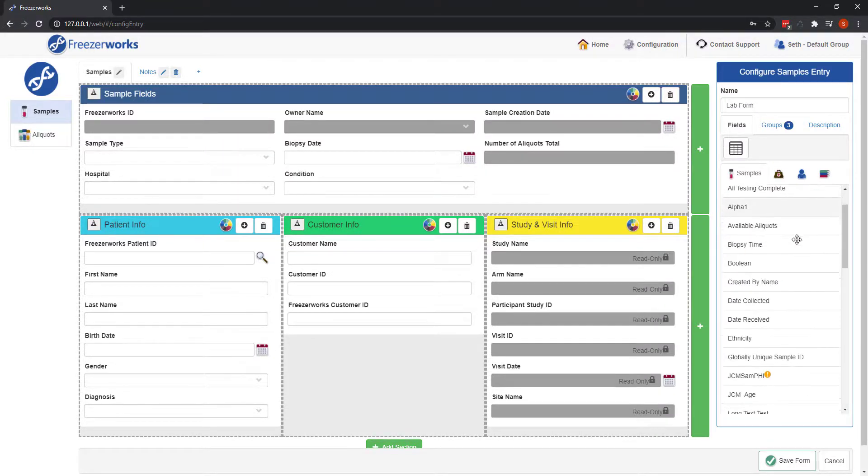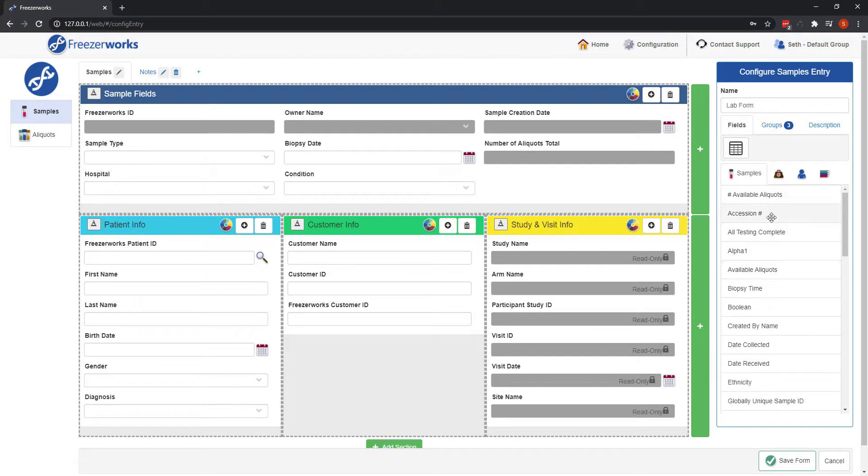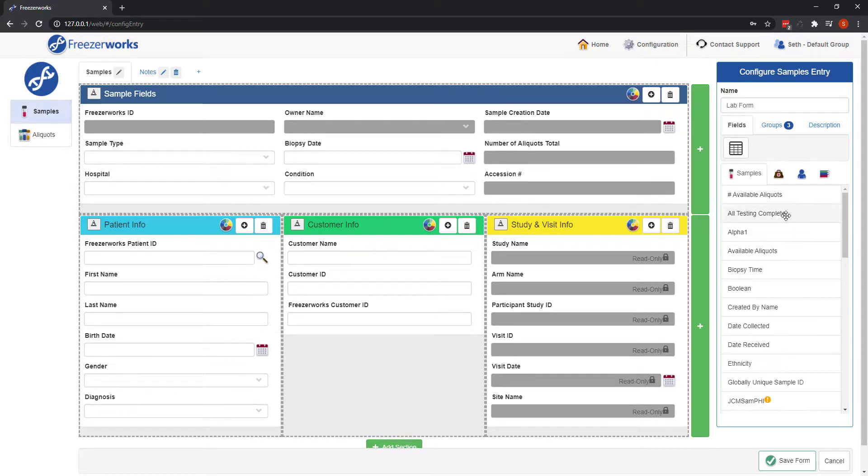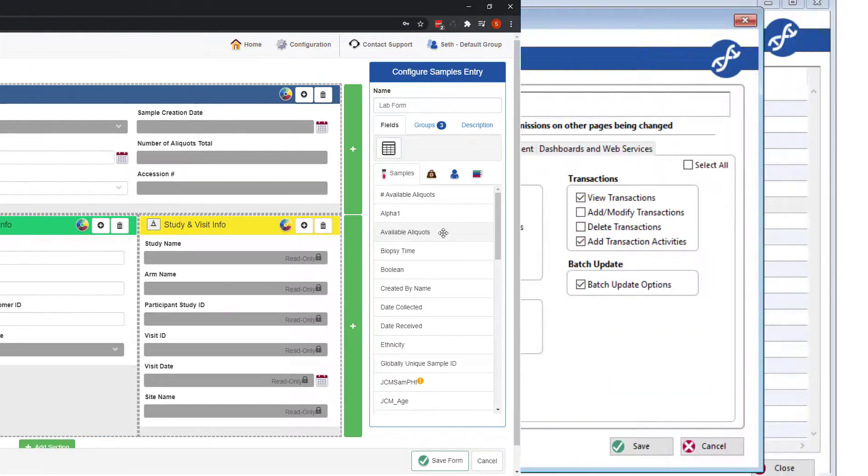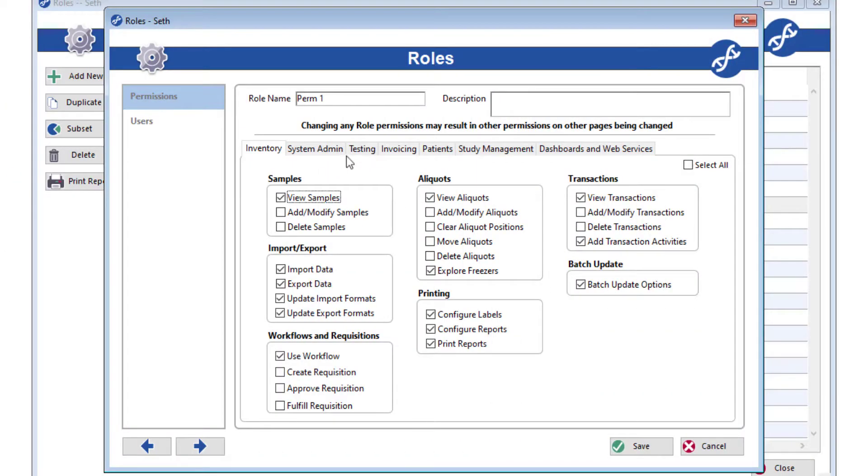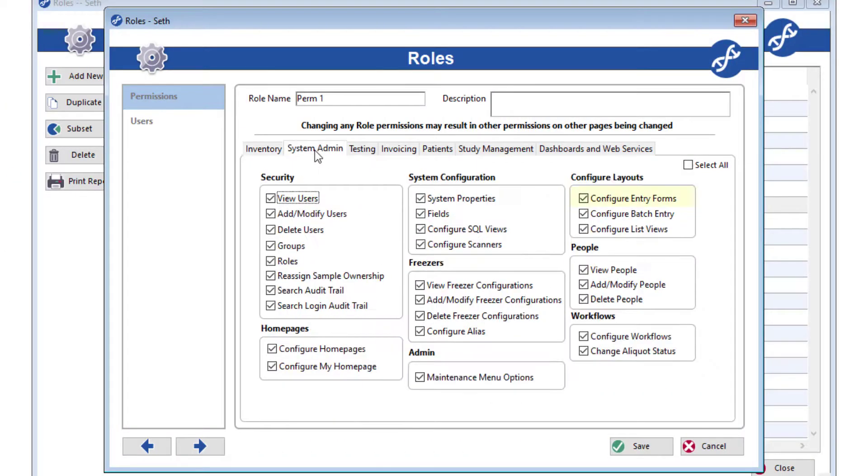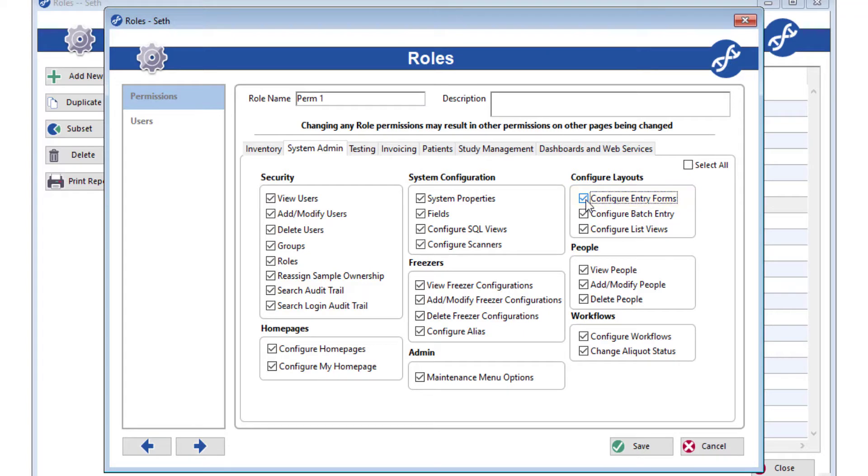In order for users to create and modify samples and aliquots on the web client, you must first create samples entry forms on the web client and assign them to the desired groups. Entry forms created on the desktop will not be available on the web. If you have permission to create entry forms on the desktop client, you will also have permission to create them on the web. If you do not have permission to create samples entry forms, or just need to know how to use them, see part 1 of this series.